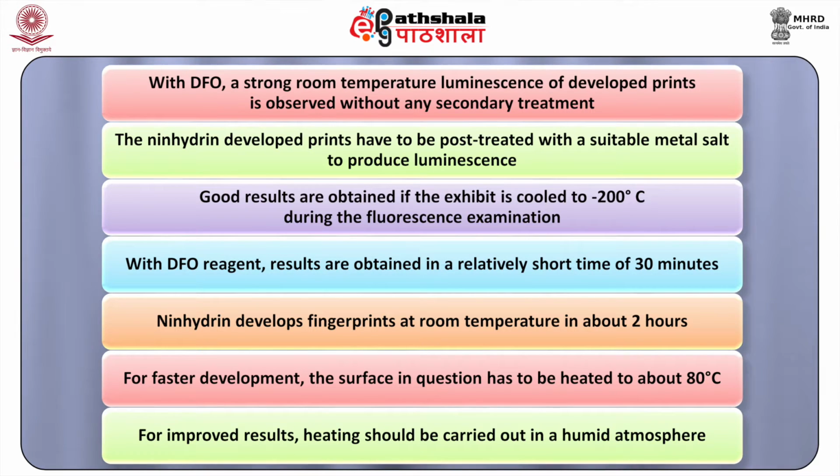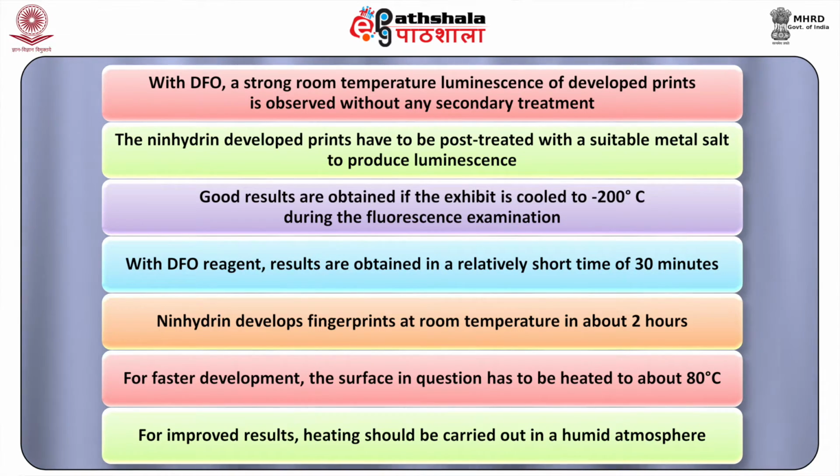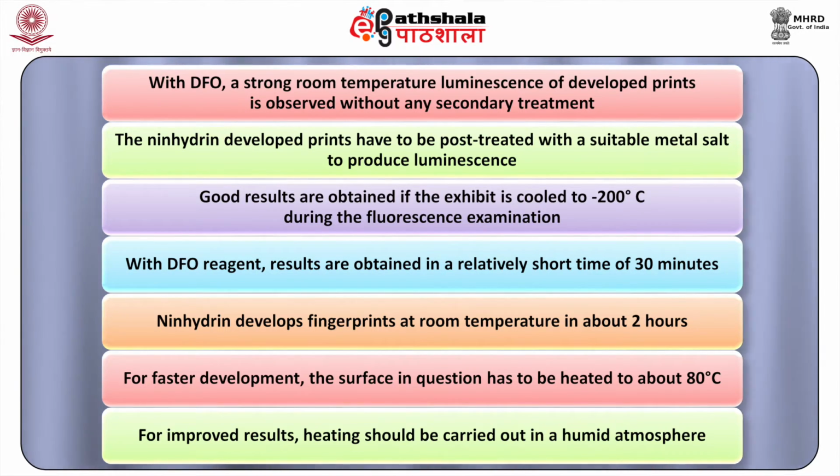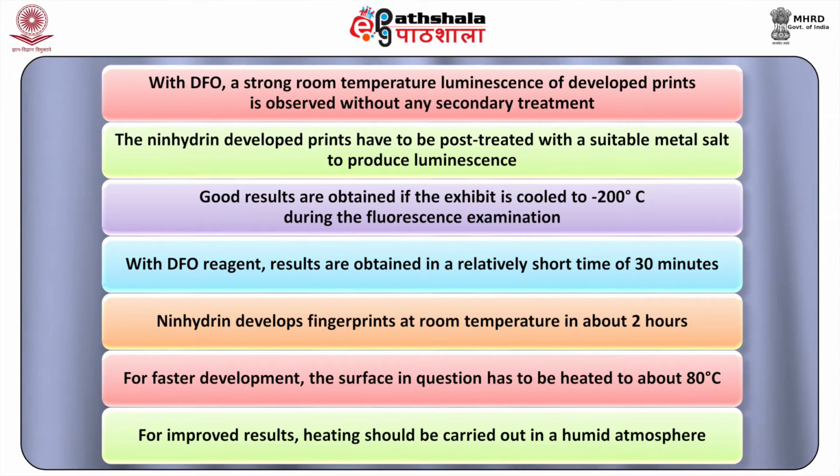Against this, the Ninhydrin developed prints have to be post-treated with a suitable metal salt to produce luminescence. Good results are obtained if the exhibit is cooled to minus 200 degrees Celsius during the fluorescence examination. Number 2. With DFO reagent, results are obtained in a relatively short time of 30 minutes. Ninhydrin, on the other hand, develops fingerprints at room temperature in about 2 hours. For faster development, the surface in question has to be heated to about 80 degrees Celsius for improved results. Heating should be carried out in a humid atmosphere.